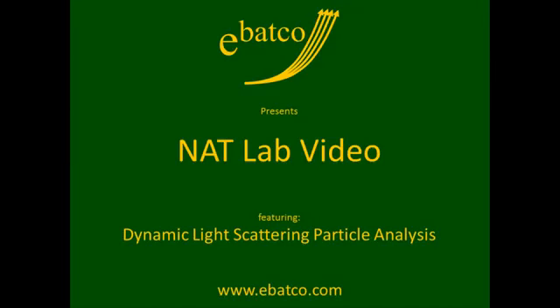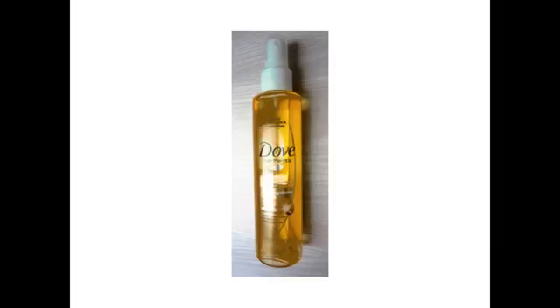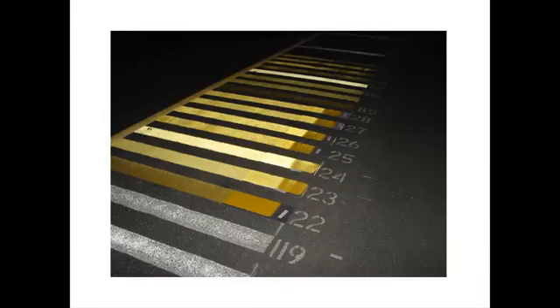In this video, we will take a look at a quick way to measure particle size using the dynamic light scattering principle. Particle sizing has a variety of applications in industry. Particle size can affect many properties including flow properties. Smaller particles tend to aerosolize better than larger ones, and smaller particles will tend to have higher suspension viscosity than larger ones in liquids. For example, particle size can determine the flavor of food products, reflectiveness and glossiness of paints, or the effectiveness of an inhaler.